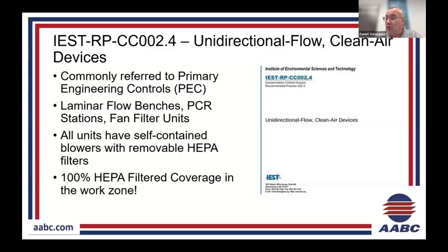So poll question number 4 was, have you ever tested a unidirectional laminar flow device?